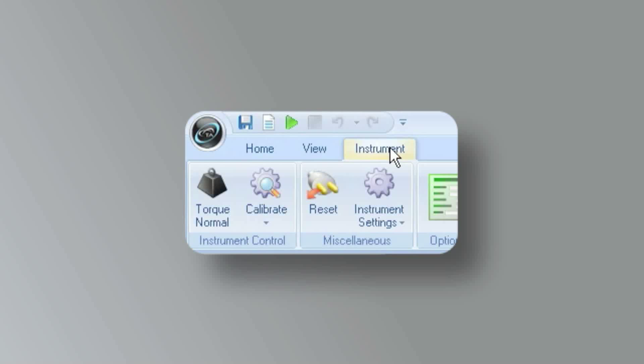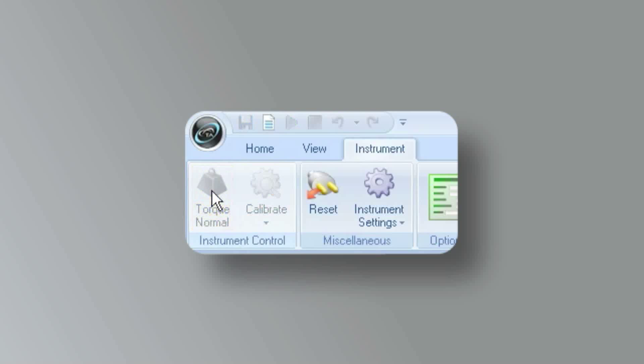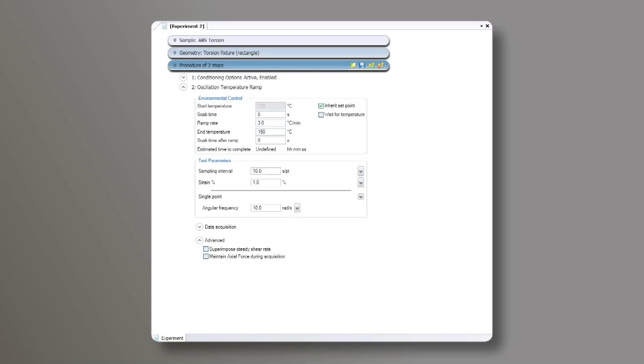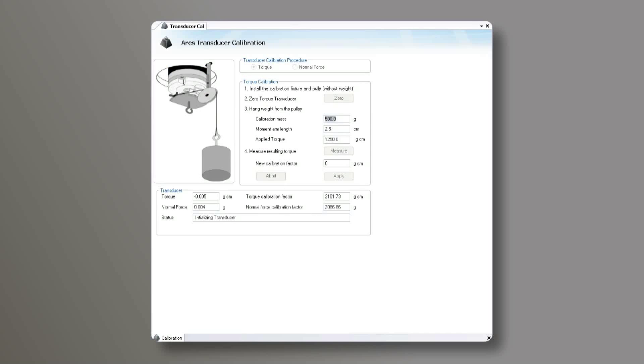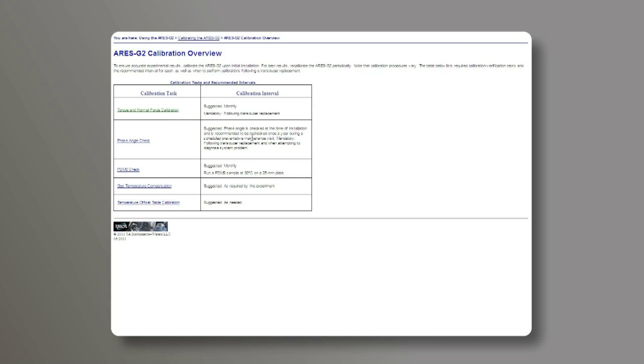To start the calibration process, select the instrument ribbon in TRIOS, then choose Torque Normal Force Calibration. We will need to follow just a few basic steps in the calibration wizard to complete these calibrations. You can also find a detailed step-by-step explanation for these calibrations in the TRIOS Help.